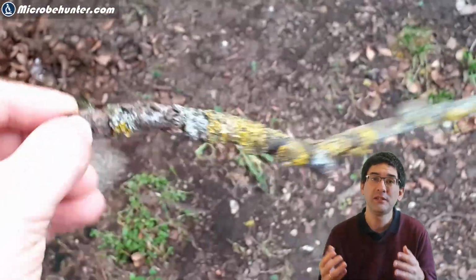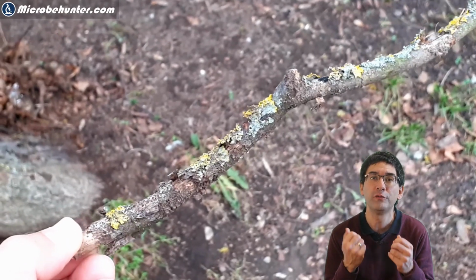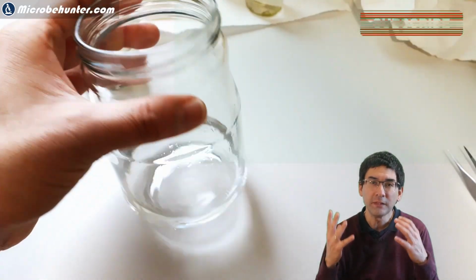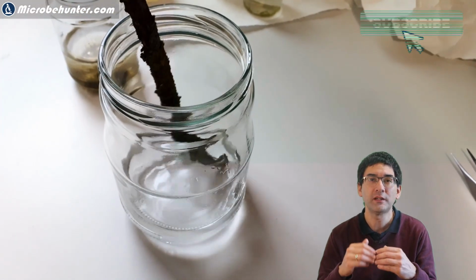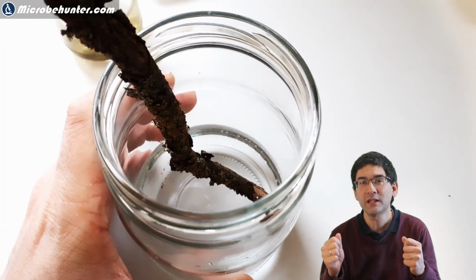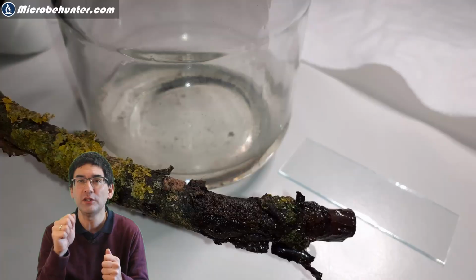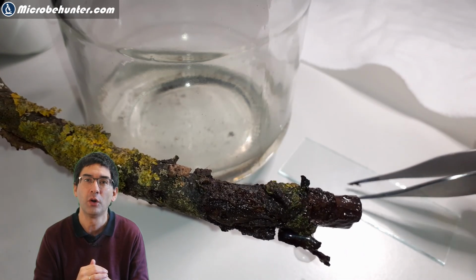Unfortunately, those pieces are often quite dry, so what you have to do is you have to put it into a jar of water for a few days. Don't put it completely in water, otherwise this is going to cut off the oxygen supply, but make sure that some of the wood is also in the air. And this means that you can then take some tweezers and you can scratch off some of the decomposing material from the surface of the wood.